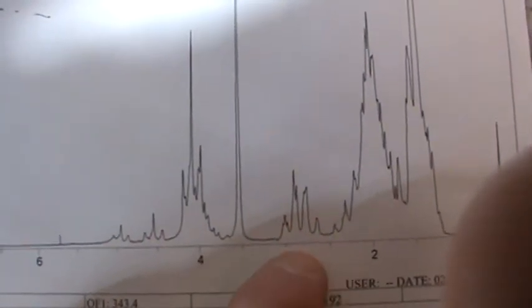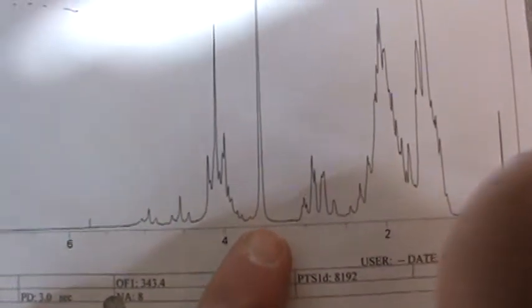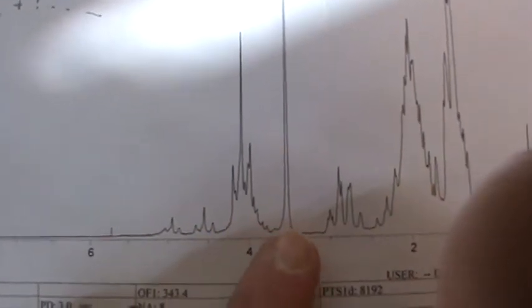Wow. We've got the aldehyde peak, and then we shift down here and it's like, whoa. So clearly this signal, triplet at 2.6-ish, that is one of the CH2s of the product. But then look at right here, right on 4. And then you have another triplet and another triplet. And then you have this singlet, this very, very tall singlet at 3.5-ish. That signal right there is almost for sure water. Some people can have this tall water peak a little more left or right, but it's normally past 3. That's the signature of water.